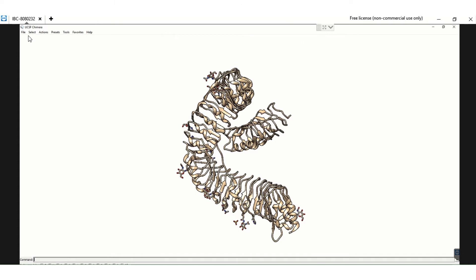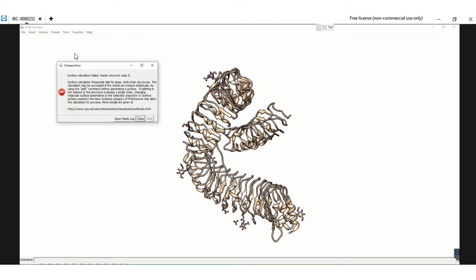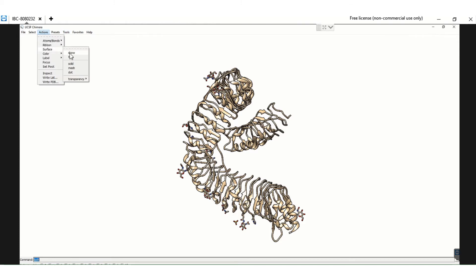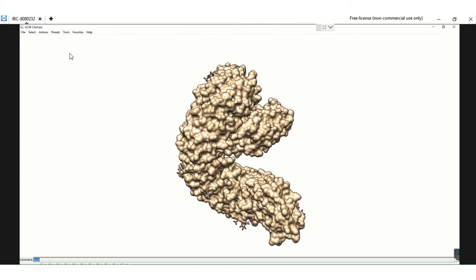Next I want to see the surface view. Go to Actions, then Surface, then Show. As you can see, the surface is not visible yet. So type 'split' in the command line box. Once you do that, the model is split into separate smaller models, which makes it easier to calculate and display the surface. Then go to Actions, Surface, Show again, and now the surface view of the protein structure will appear.